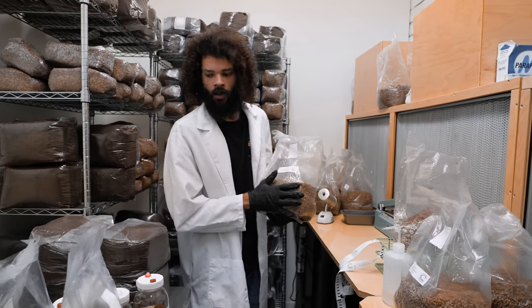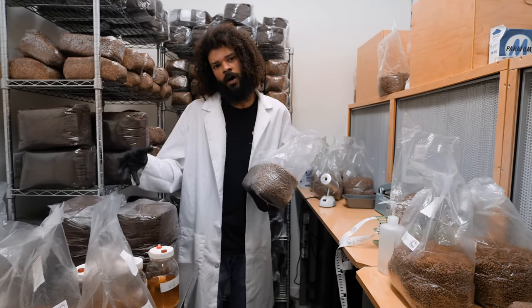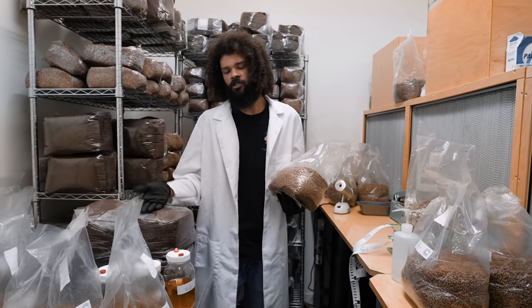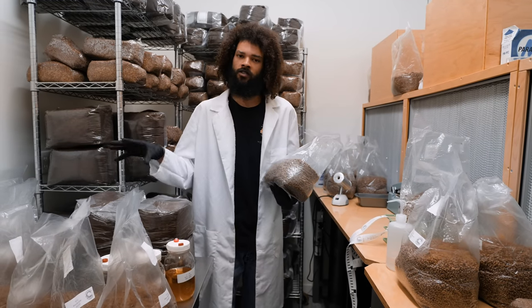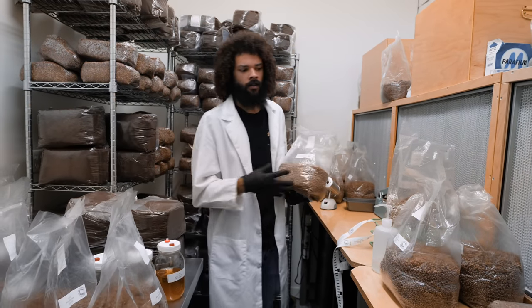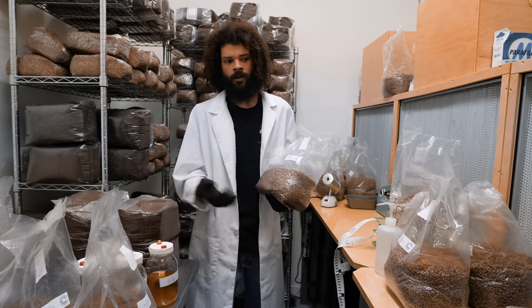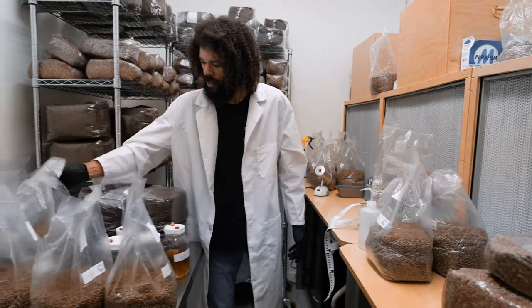Another thing I do is go grain spawn to sawdust for certain species, and then use that sawdust as spawn as well. So from one grain spawn bag I can inoculate twelve blocks, those twelve blocks can be broken down to go to 120, and those 120 can turn into twelve hundred — all starting from just one single petri plate. But the further you expand, the weaker the strain gets and the lower your yields. So I recommend going grain spawn to sawdust to sawdust, then fruiting. That works very well, especially with shiitake.